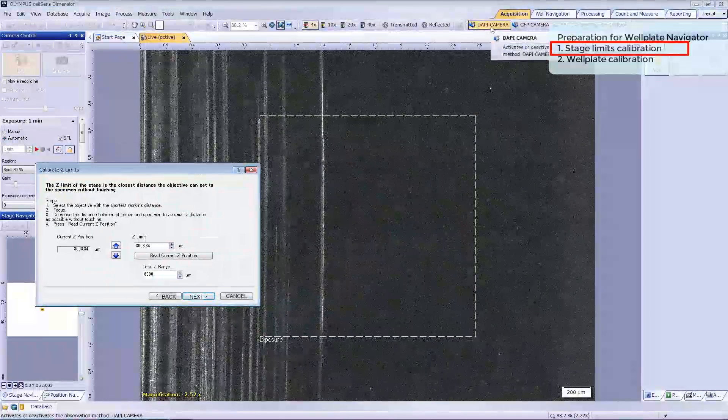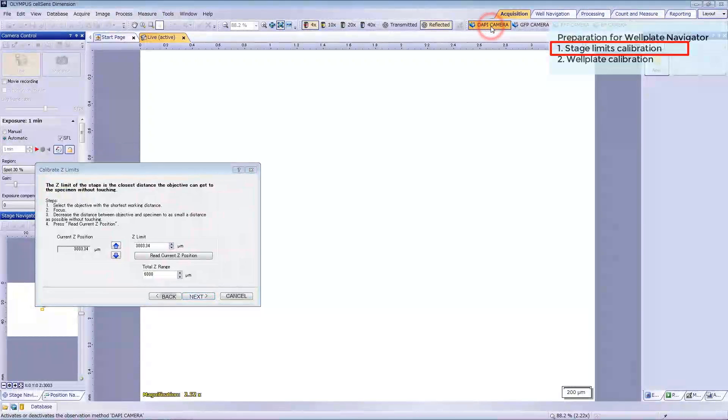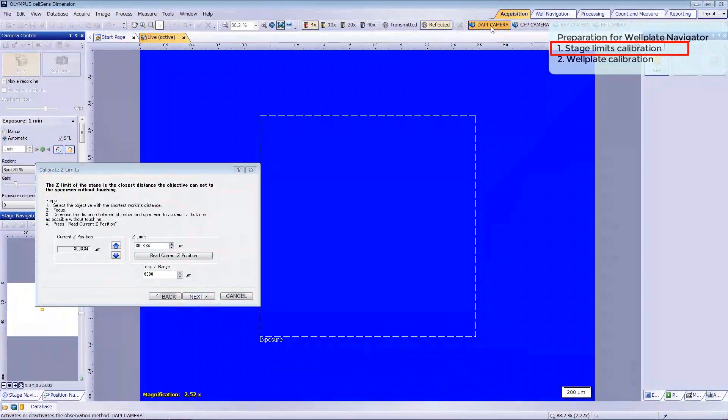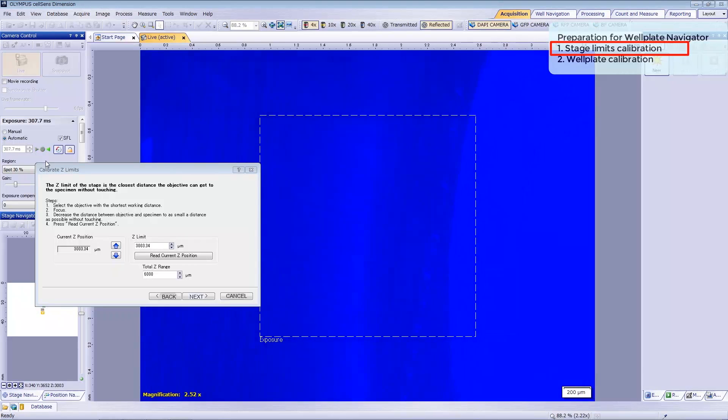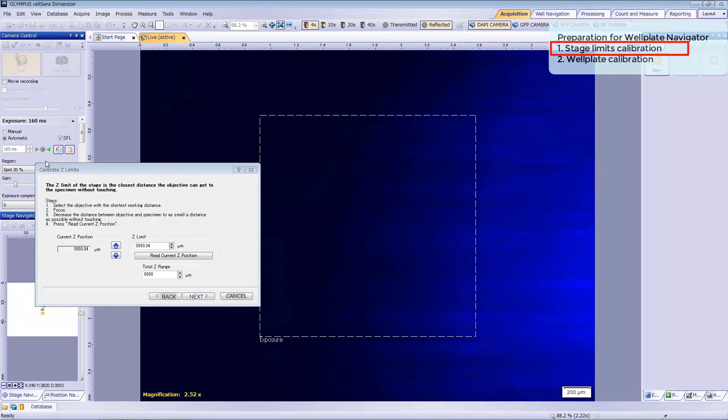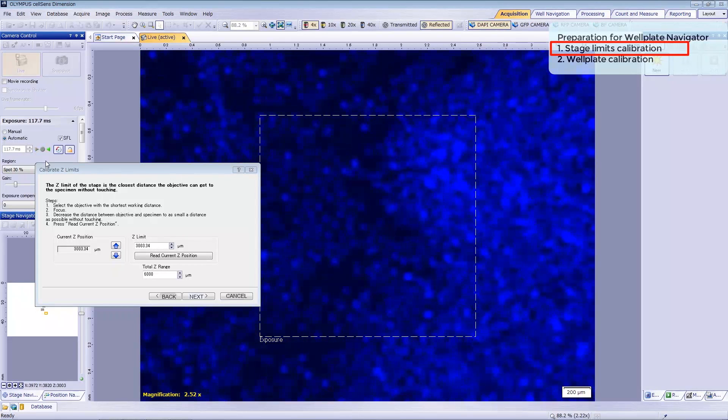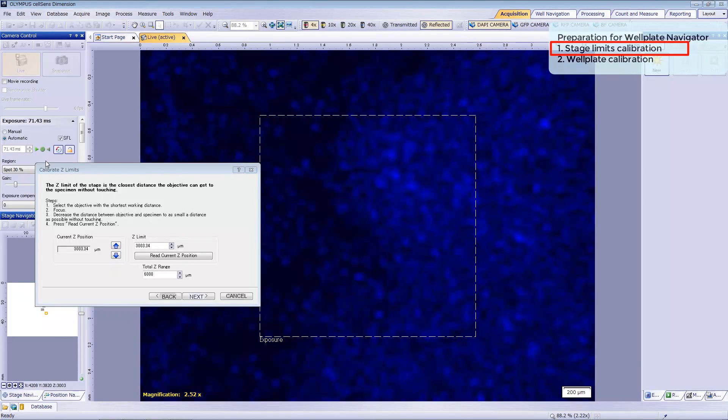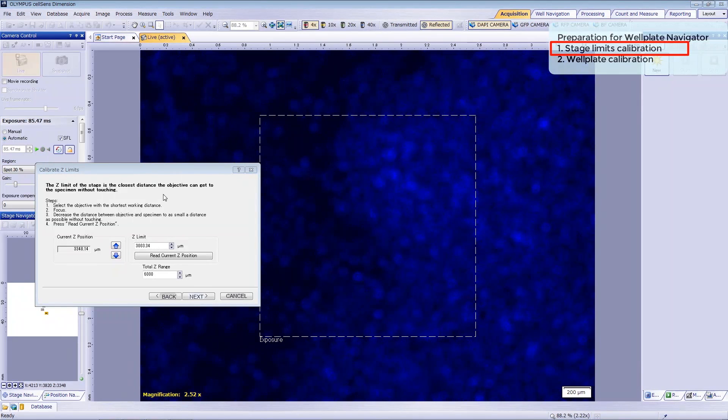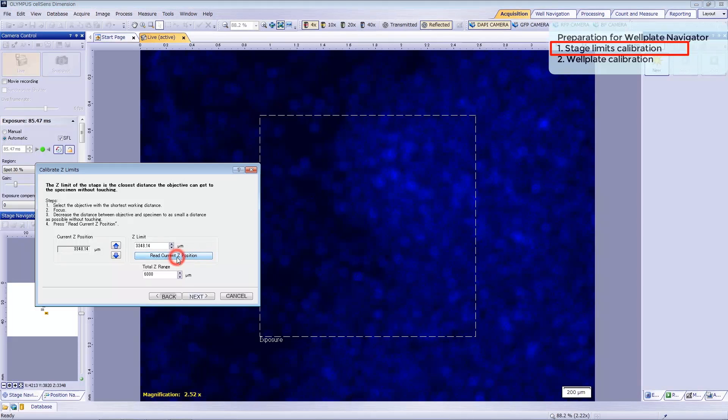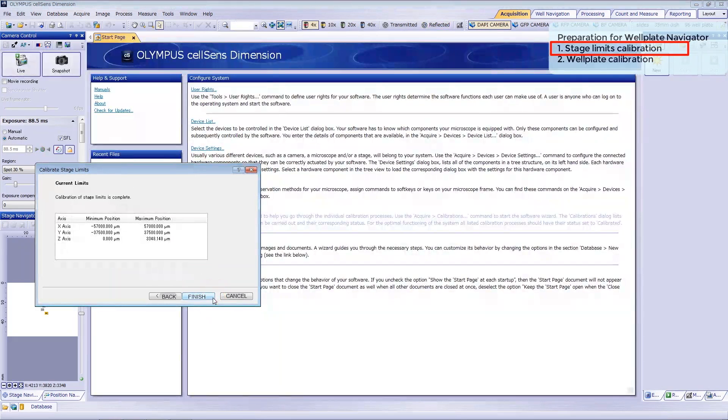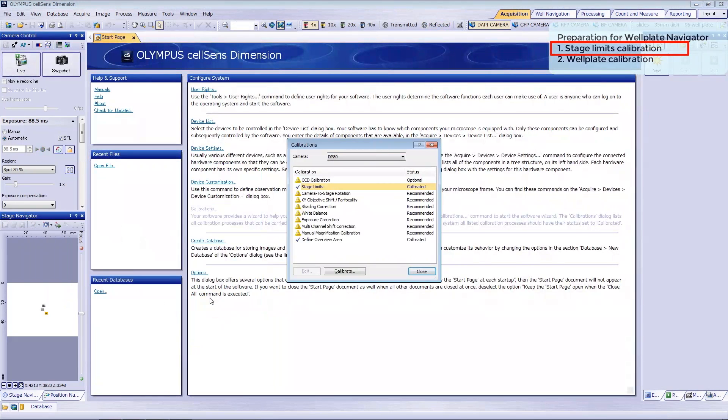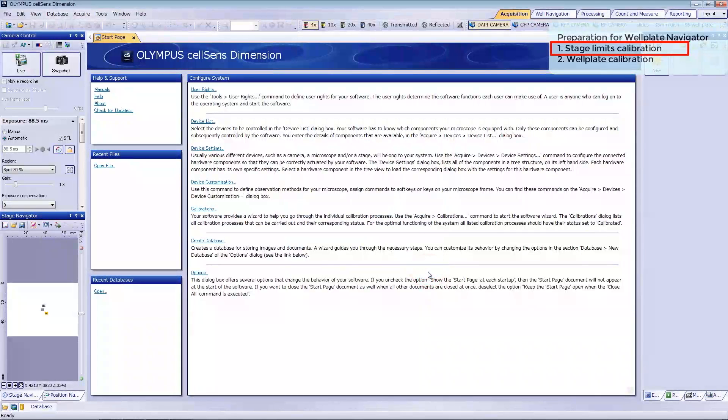Select the observation method and either focus on your sample or on the top surface of the wellplate using transmitted light observation. Drive the Z motor up slightly and then click Current Z position to set the limit. Click Next, then Finish, and then Close.